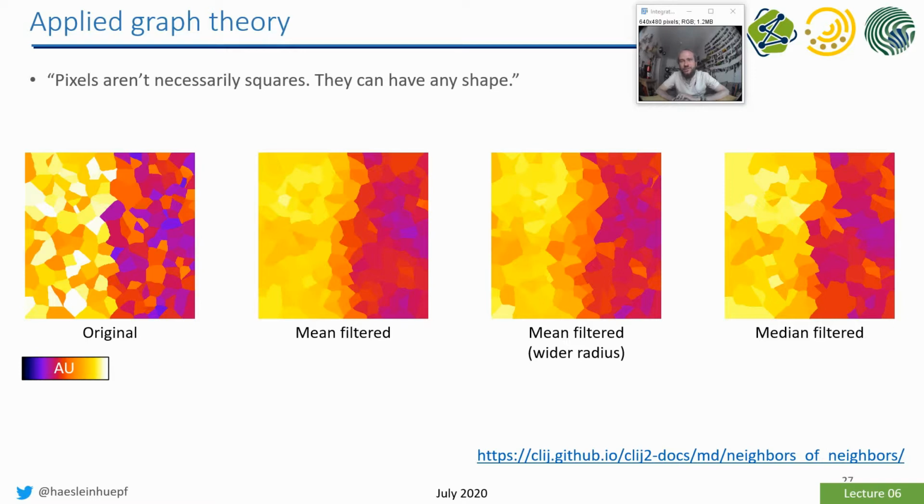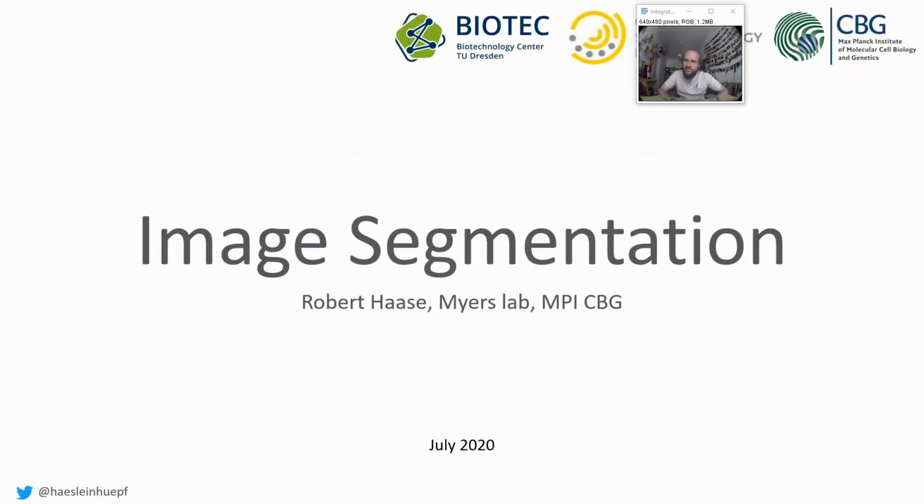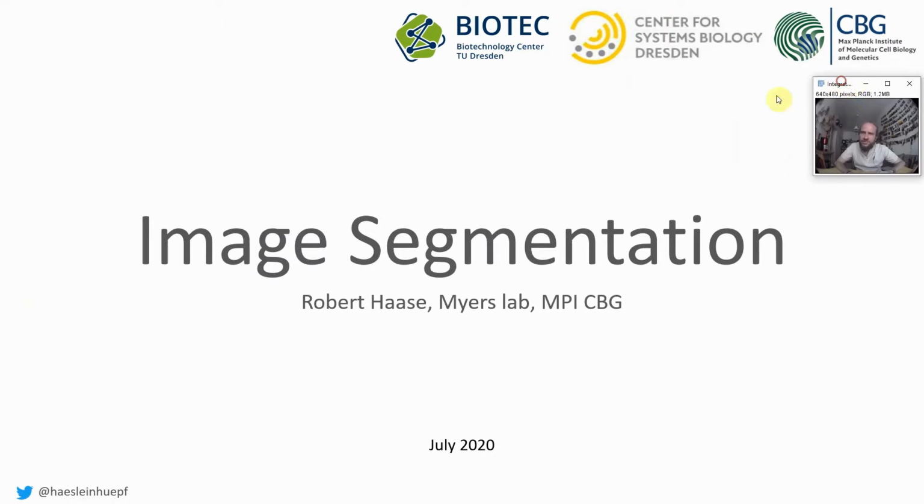We are working a lot with images representing cells. These cells are communicating with each other, they are exchanging signals with each other, chemical signals, for example. And image processing in this particular way may allow us to understand better what is happening here on a cellular level and not on a pixel level. That brings us to image segmentation.